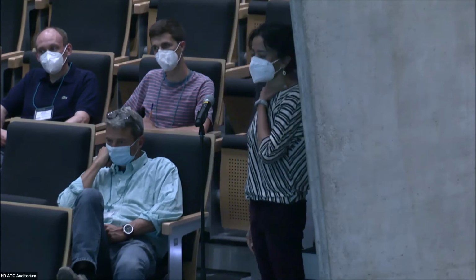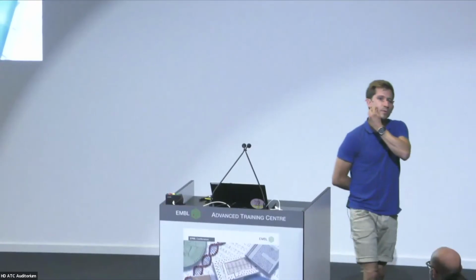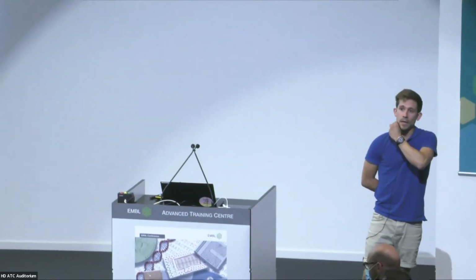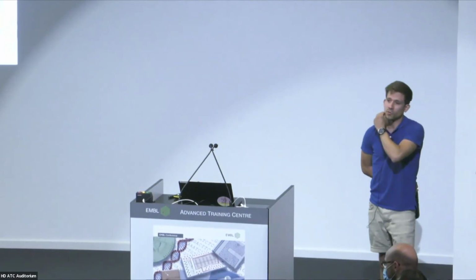Yeah, so the first question, they are producing enough mucin, so we stained them with Alcian blue. I didn't show it today, but we did check that. They do offer some protection because when we do the studies with the CACO2 on their own, they are more susceptible than when we do the co-culture with the HT29s. You asked about the pH. We don't do the cultures with low pH. So we don't have cells on our digestion chip. We only have them on the gut chip. So on the gut chip, we are still using the normal culture media pH, which will be around 7 or 7.4. So that doesn't apply there.